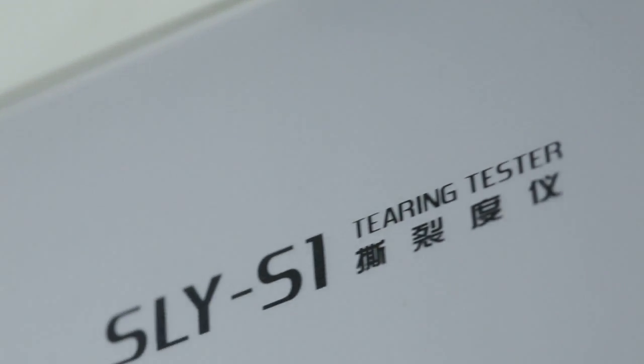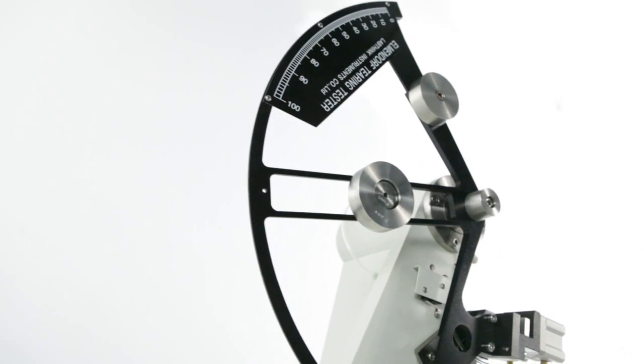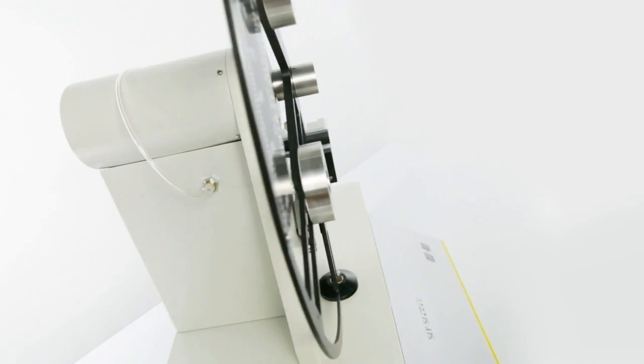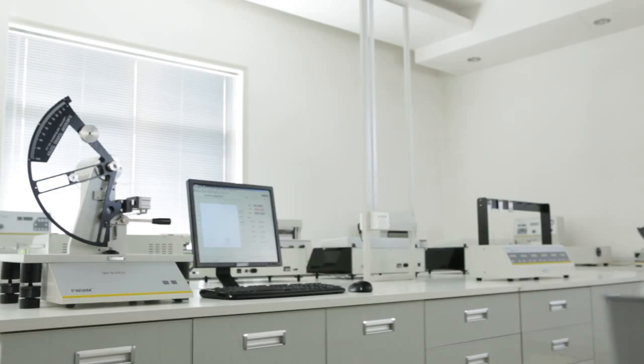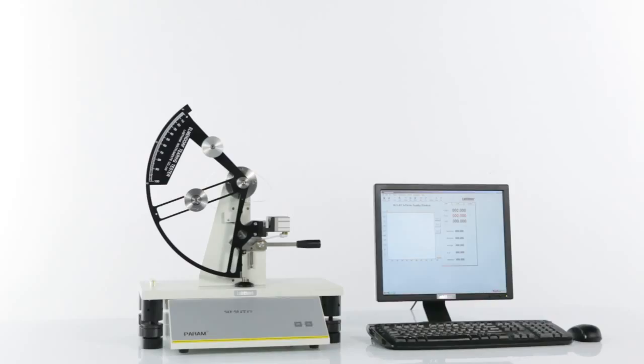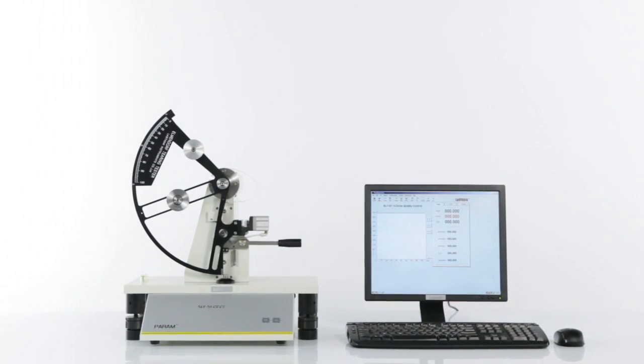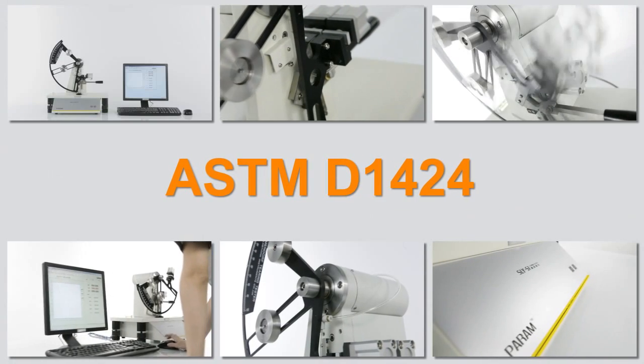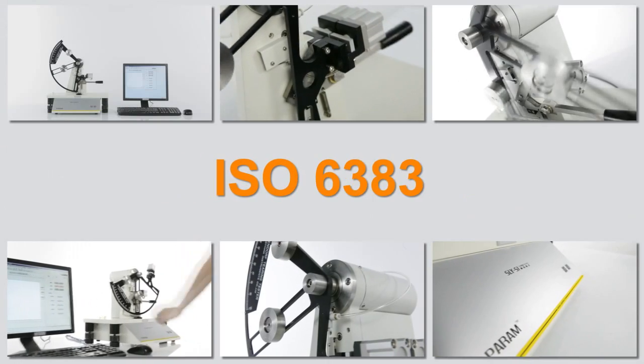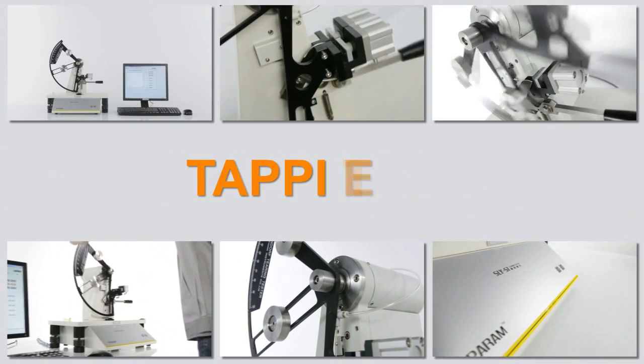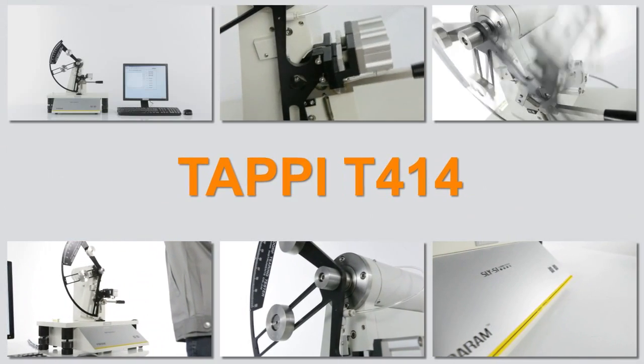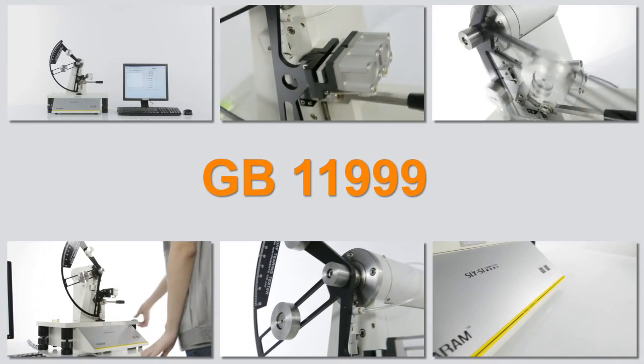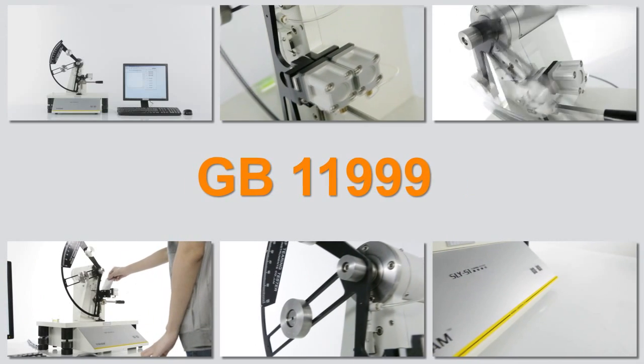SLY-S1 is LabThink's latest generation of electronic tearing tester, which is designed according to the Elmendorf Tearing Test Method. The testing principle complies with ASTM D1424, ISO 6383, TAPPI T414, GB 11999, and other standards.